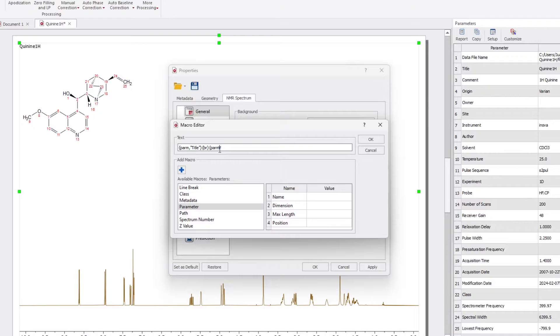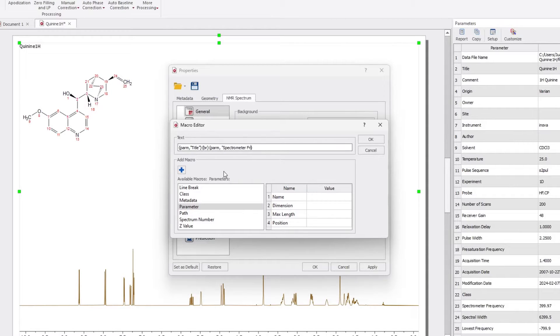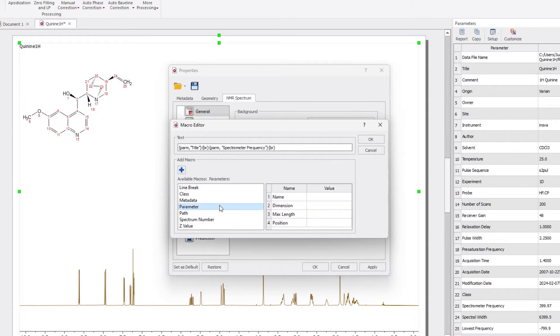Now, input the desired parameter, such as Spectrometer Frequency. Repeat the process for Solvent parameter.